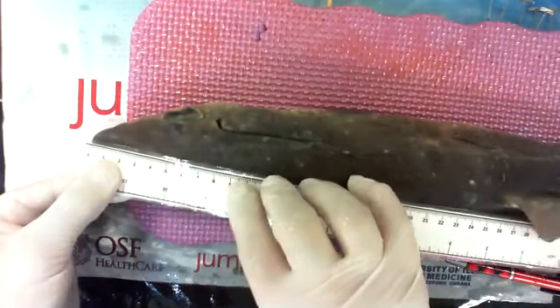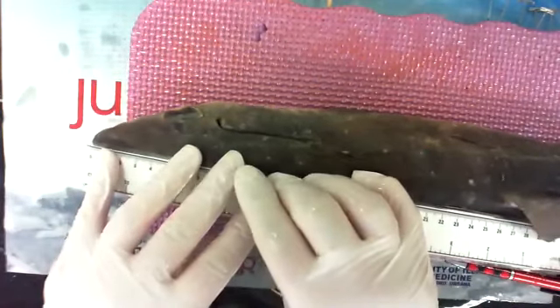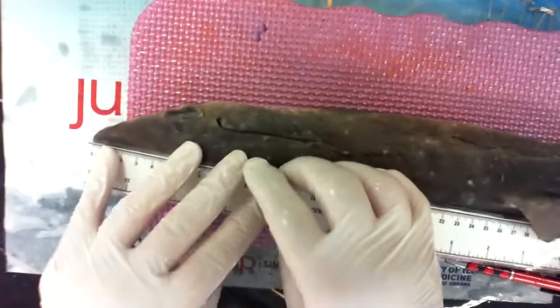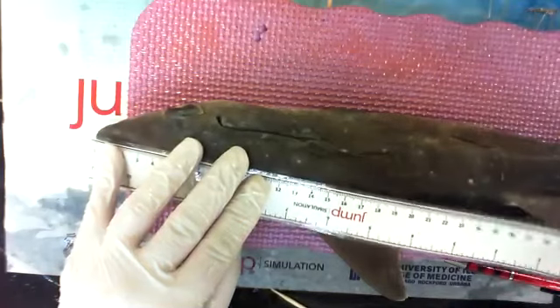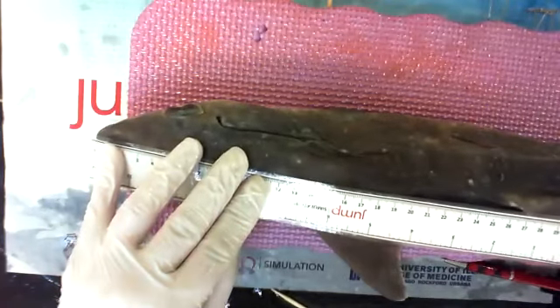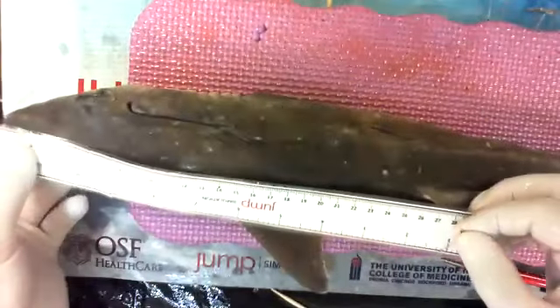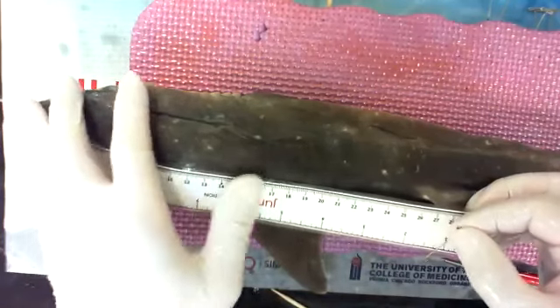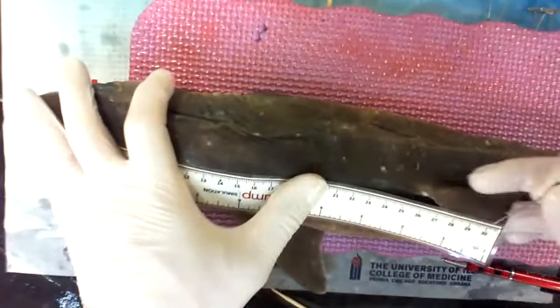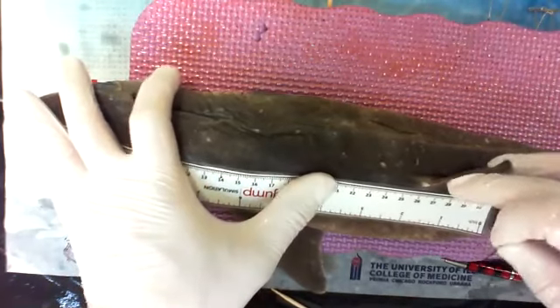I laminated mine. Actually, Annie laminated it for me because she helps out with all the stuff so that I can rewash mine over and over again, which I'm finding out is a pain because it's hard for me to stick exactly on the mark with a laminated one. So I'm going to slide this down just so you can see what I'm doing. You saw me put it up to the 0. There you go, 0. I'm holding it down completely, following along, making sure it doesn't slip.